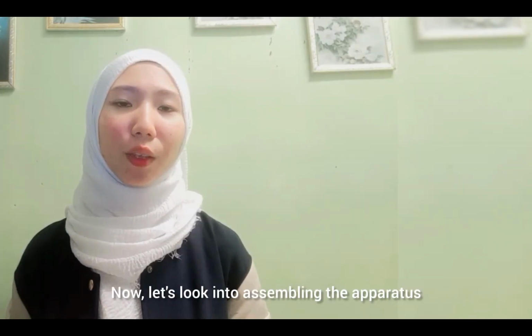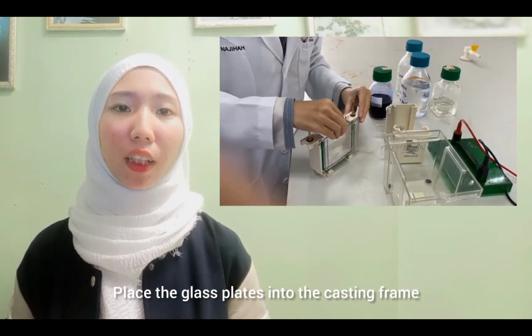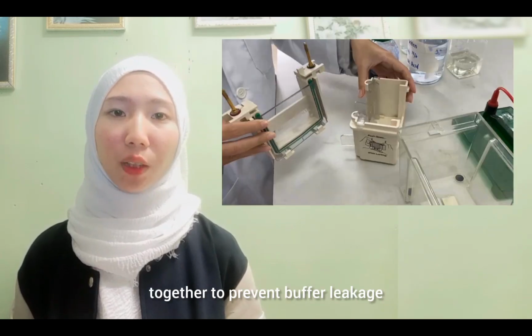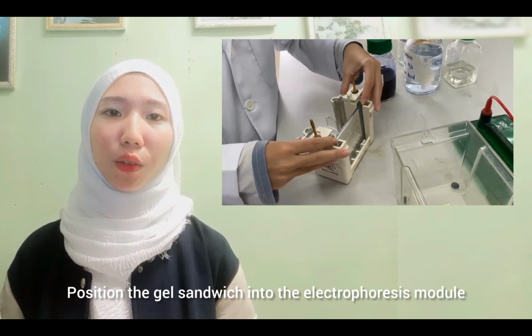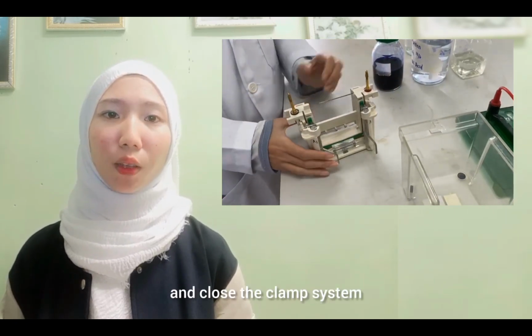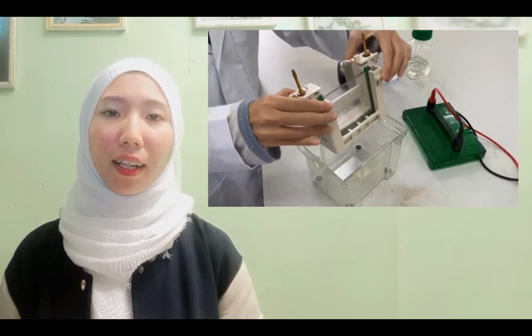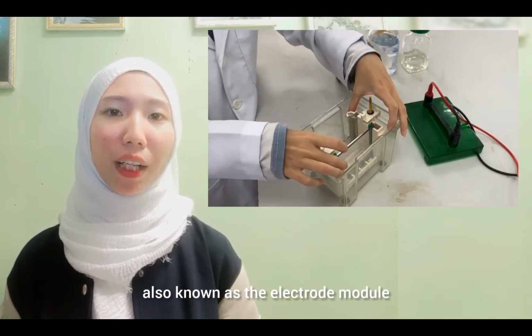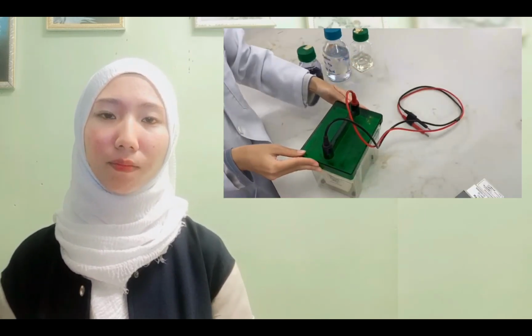Now, let's look into assembling the apparatus. Place the glass plates into the casting frame. Ensure that the plates are tightly clamped together to prevent buffer leakage. Position the gel sandwich into the electrophoresis module and close the clamp system. Carefully slide the gel holder into the buffer chamber, also known as the electrode module.